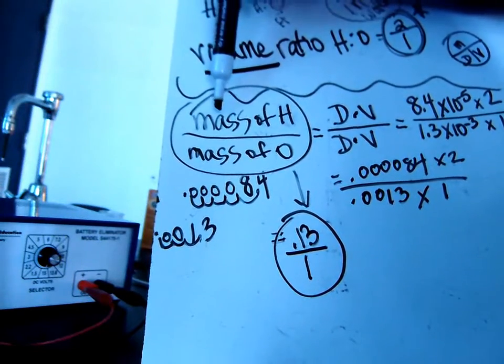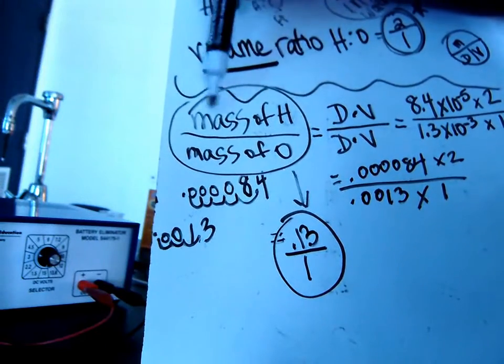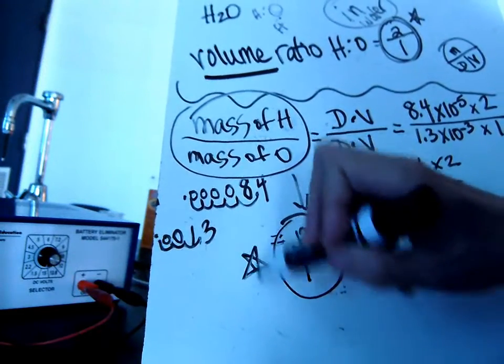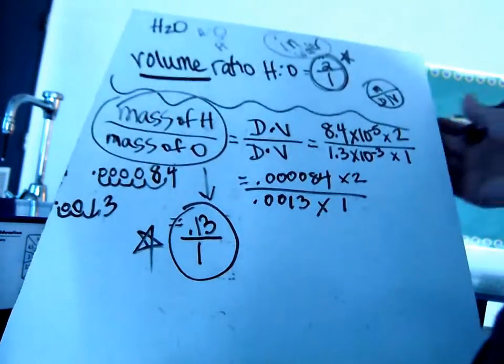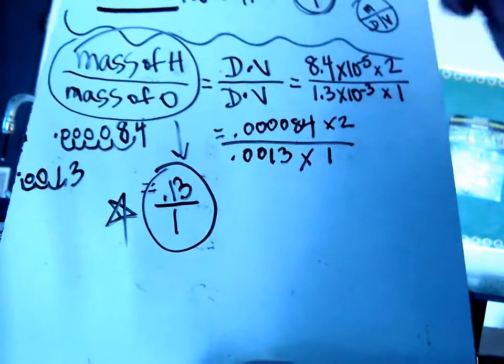When I break apart water and I compare how much hydrogen to how much oxygen in terms of their masses, the mass of the hydrogen produced compared to the mass of the oxygen, this is your number. And that is super, super, super important. And I'm going to show you one other way to back this up, another way to get to the same thing.